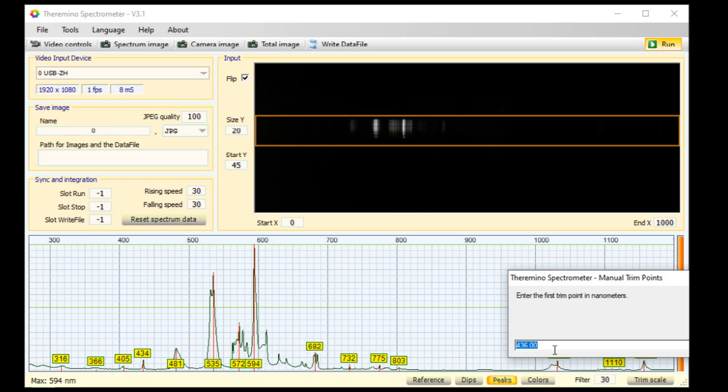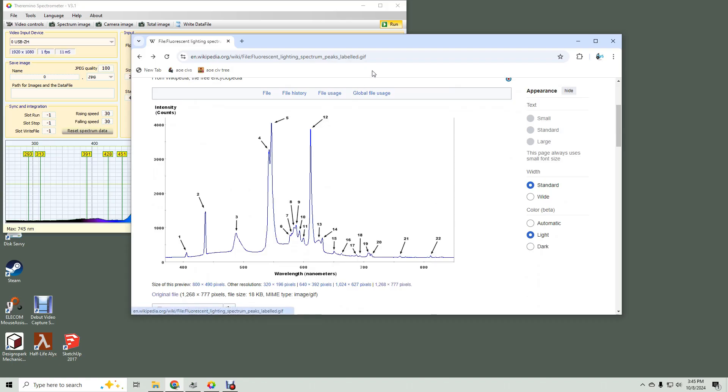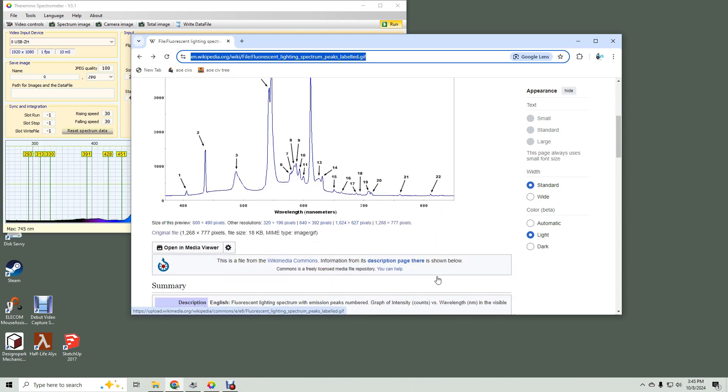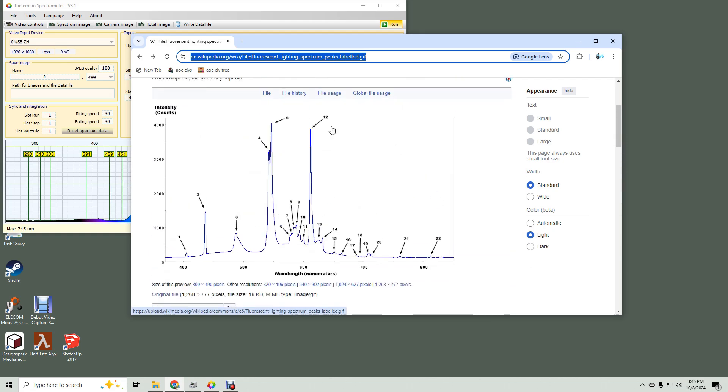Set the first trim point to 546.5, which is the brighter mercury line, and set the other to 611.6, which is from Europium. This webpage is fantastic for finding good peaks near other spectrum lines if you want to pick points closer to where you care the most, such as in the infrared. I picked peaks 5 and 12.